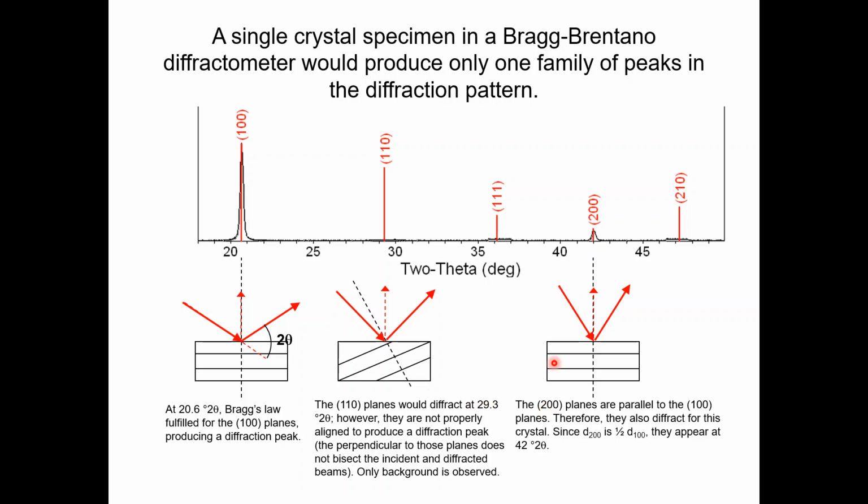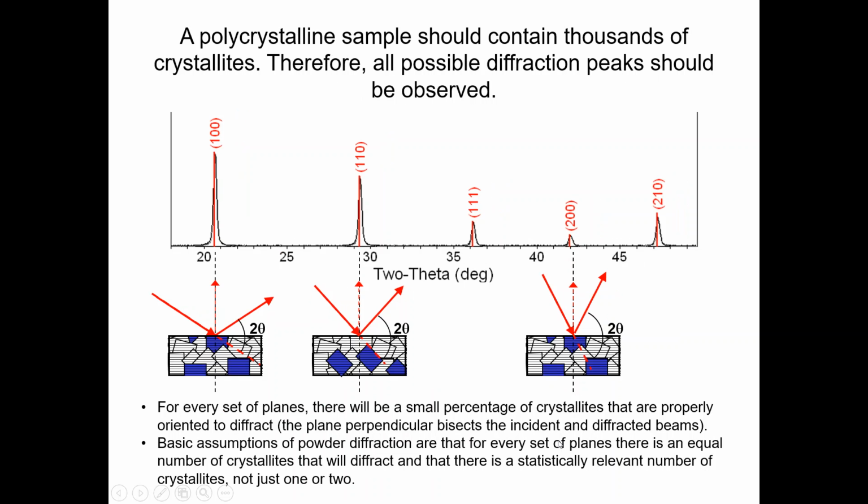You can see here that the perpendicular to the incident and diffracted beam, and also the perpendicular to the planes, are lying in the same plane. You can also see the nature of the peaks, how they look. You can observe what you observed on the previous slide more clearly in this particular slide.